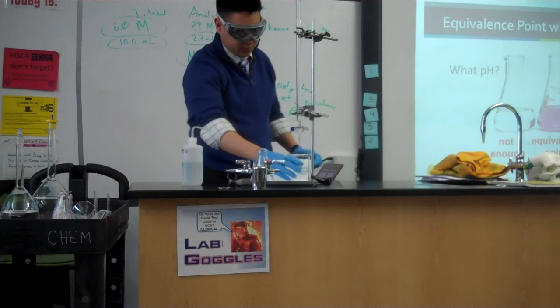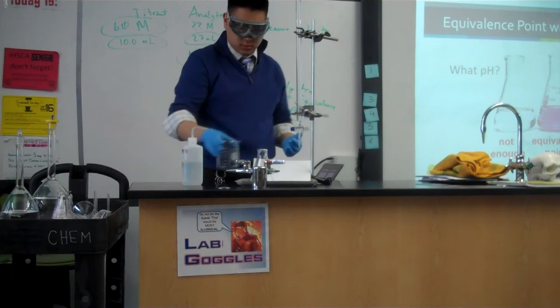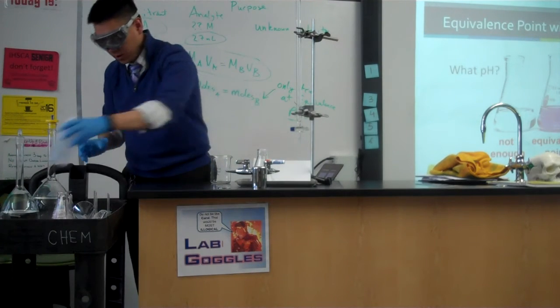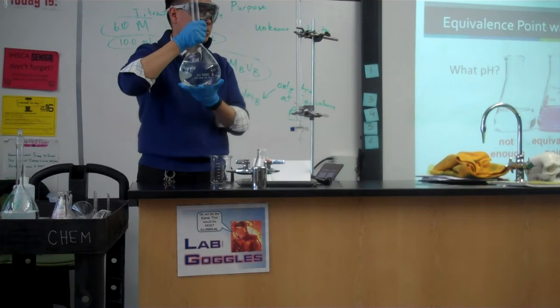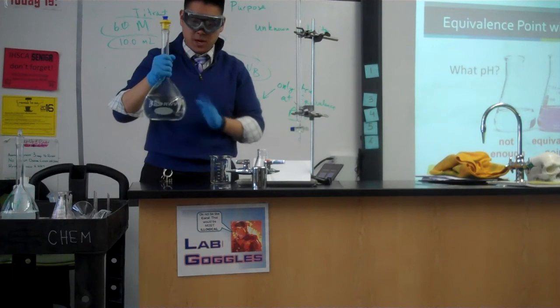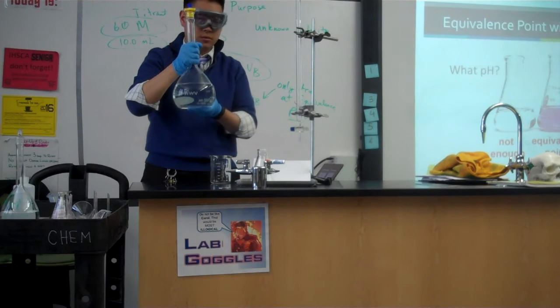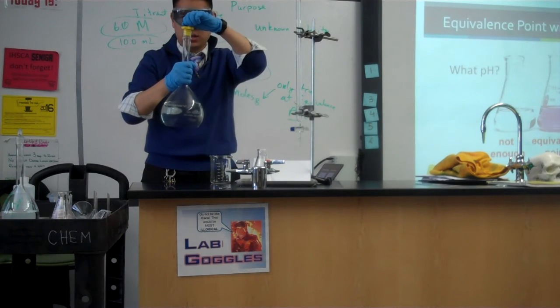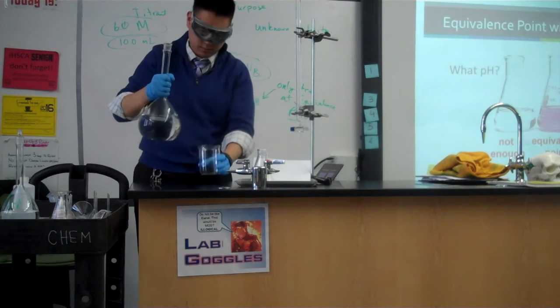Okay, now we're going to need our titrant. So this is where our second part comes in. We have our titrant, 0.66 molarity sodium hydroxide. I'm not going to have it in here for you tomorrow. This is harder to pour out because it gurgles a lot. So tomorrow you'll have it in a different container. You're going to need to pour some out into the beaker.